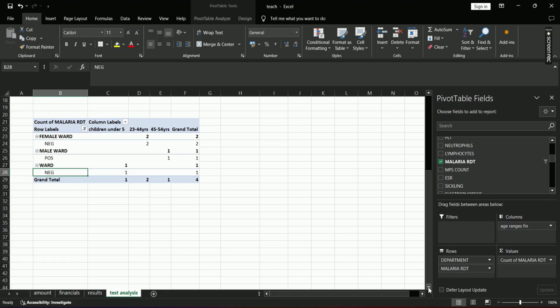And likewise, if your HIV results are captured on your software, your DIMS, or if you are using Excel, if you are using Access, then it will be easy to repeat this same process for your HIV monthly reporting.